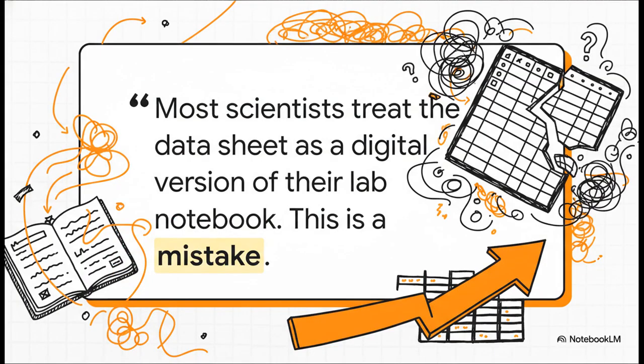And this, right here, is the core mistake. It's the one thing so many of us do. We treat a spreadsheet like it's our lab notebook, a place to just jot down notes and numbers. But that one single habit costs us days, sometimes even weeks, of just tedious, mind-numbing data cleaning. It is time for a huge shift in how we think about our data.